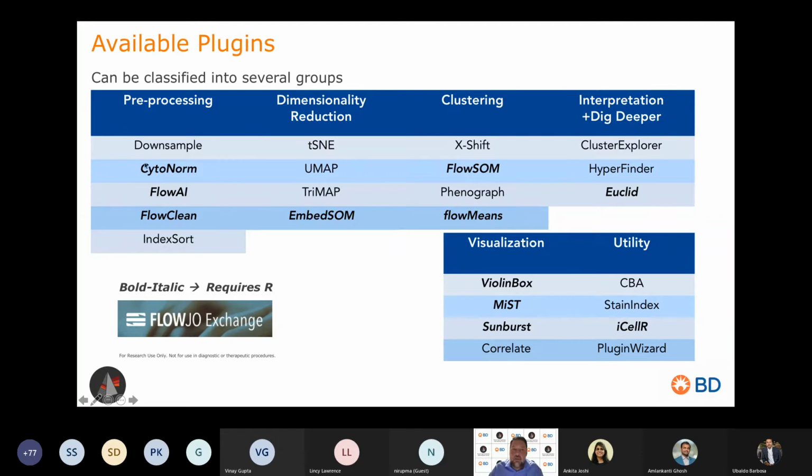And the essential thing that you need there is the same sample run every single run. So you want to pick a sample that you have lots of cells from, or maybe make a buffy coat sample where you can make tubes of cells that are frozen, and you can pull that same sample every single week, run it through your assay, and so you have a consistent sample from week to week.